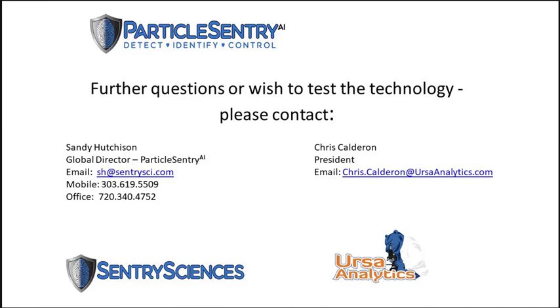They will definitely differ. So when you're doing this technique, you need to lock down the instrument that you're interested in looking at. Each of them has different advantages in terms of camera resolution and other tunable parameters. But in theory, yes, this could all be applied to MFI, and we have applied it to MFI in the past. We just haven't published it.